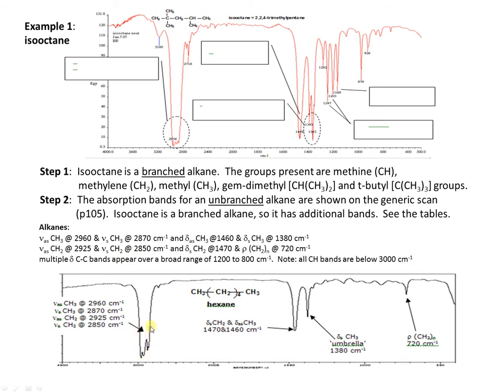So we generally get 4 bands that overlap and are not resolved or separated by the spectrometer. Now looking at this, you can see definitely that there's more than 2. So if we didn't know what this compound had in it, we could probably conclude safely that it has both methyl and methylene present in it.